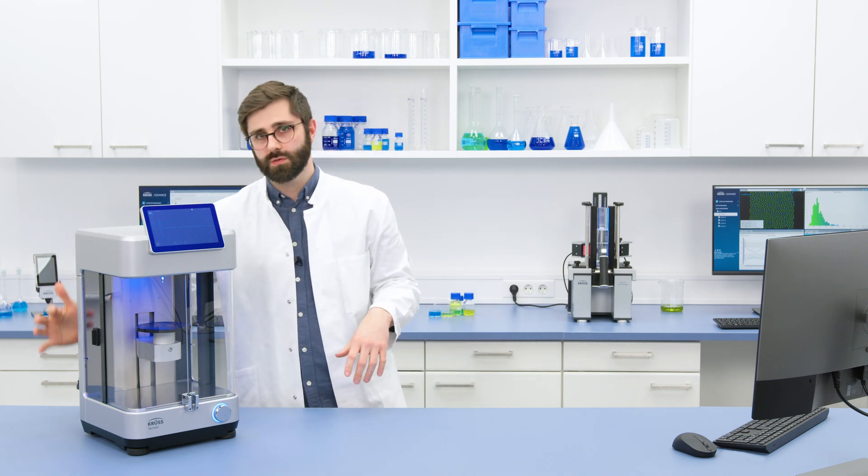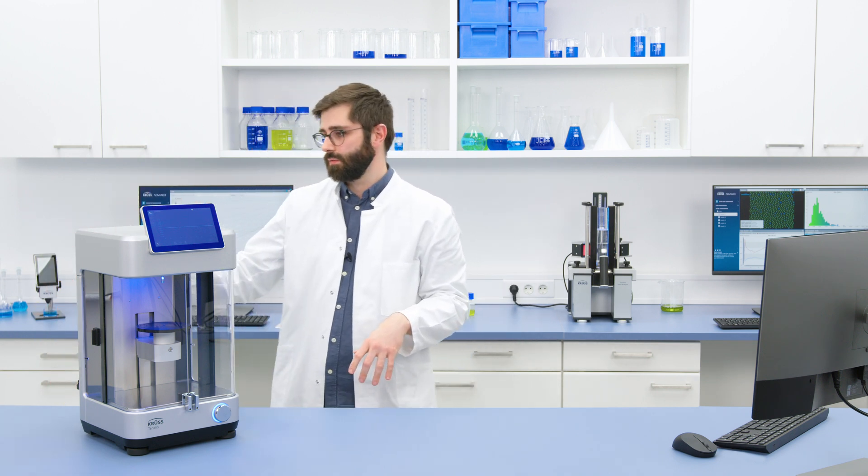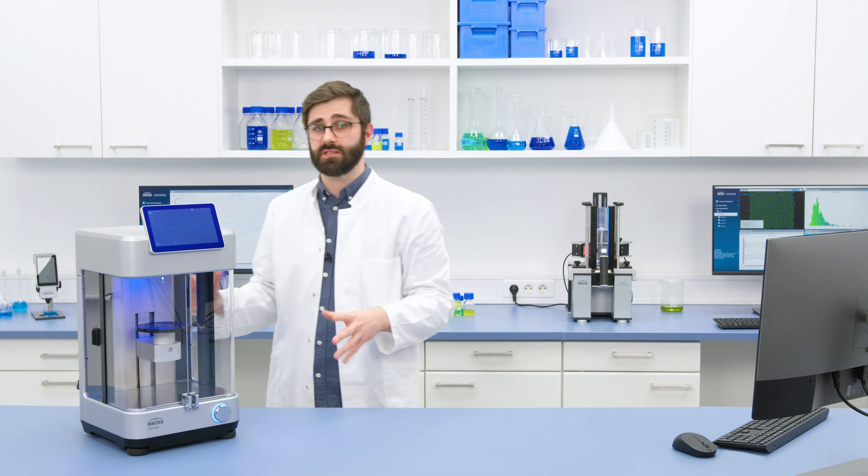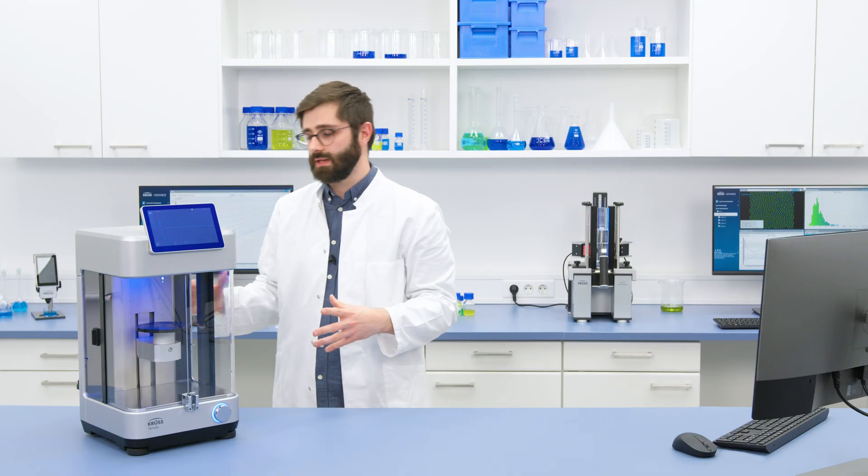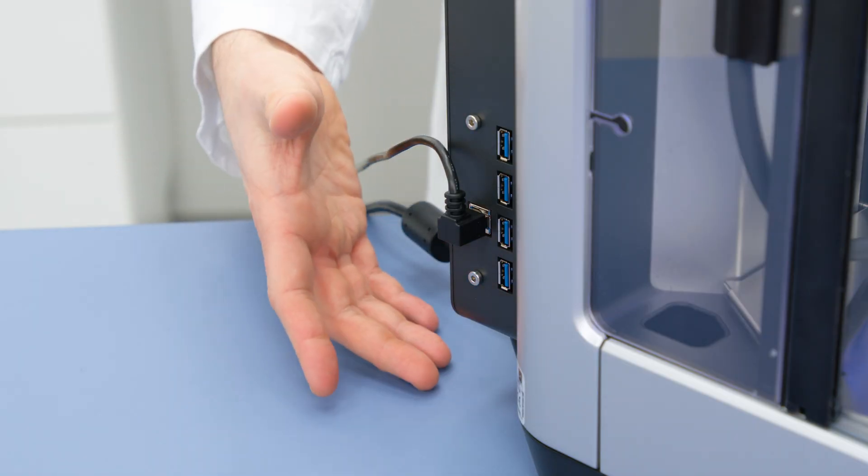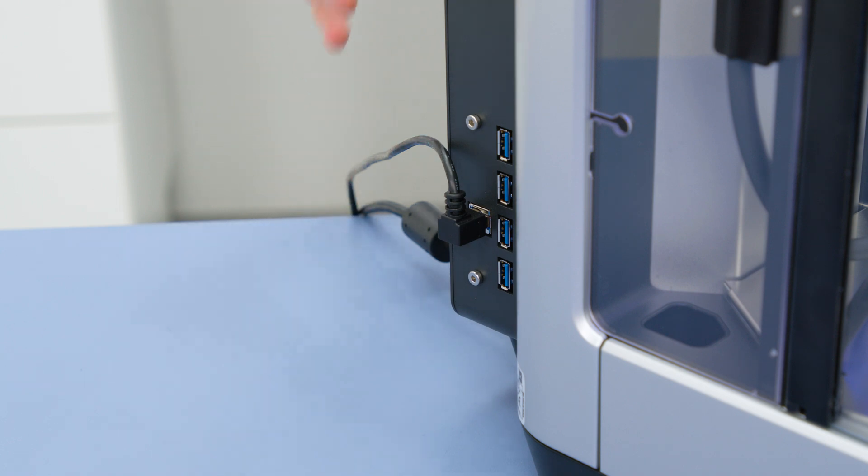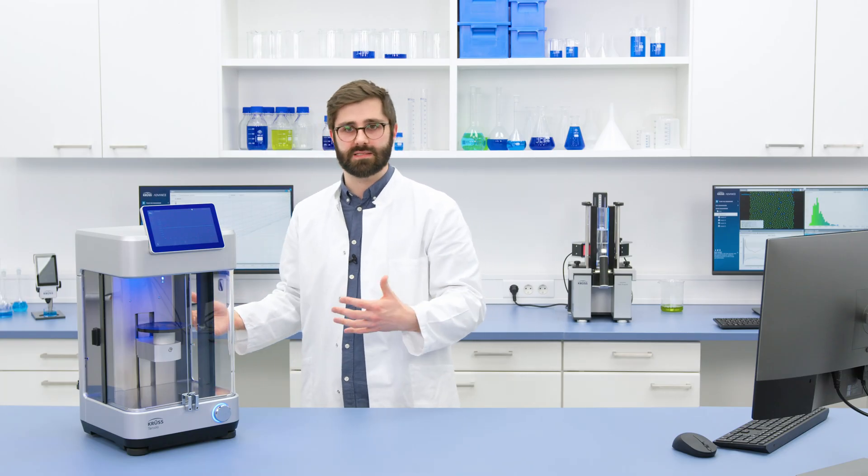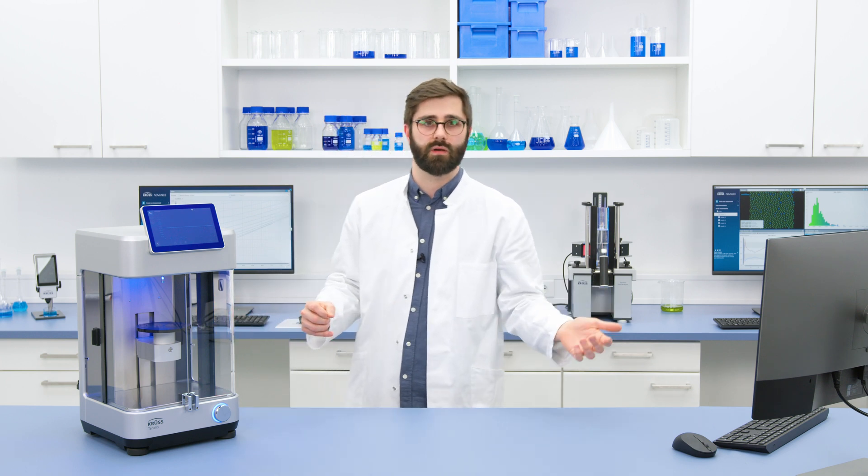We've also added at the back of Tensio a USB hub where you can connect all different kinds of Kruse accessories or accessories for anything else. This USB hub will be directly connected to the PC, so you can use it to tidy up your lab desk and connect other USBs that may be from different devices or running to one PC with one cable.